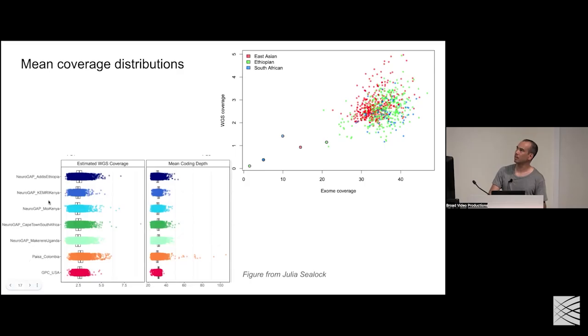One of the things I wanted to outline is that, if you plotted this early pilot sample after the development, the whole genome coverage and the exome coverage here, there are some winners and some losers. Obviously, these samples would have been thrown out. This was the pilot data, but there are going to be samples in our protocol that get around 1x, and they also get the lowest amount of exome coverage.